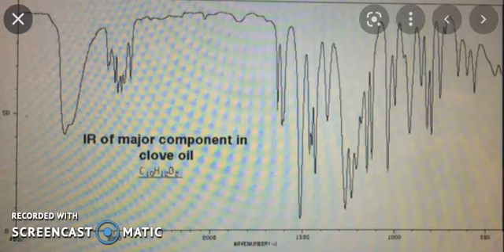You know the eugenol is found in clove oil. There is a methoxy group, there is a hydroxyl group, there is an alkenyl group, there is one benzene ring in eugenol. So I am going to show you the IR spectra of eugenol, that is clove oil.